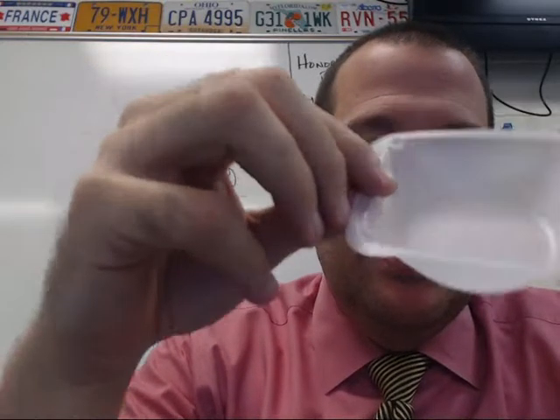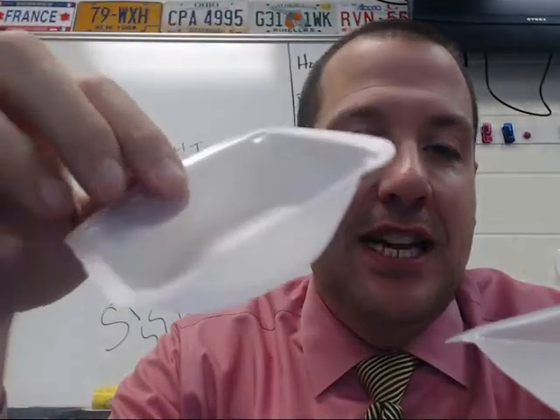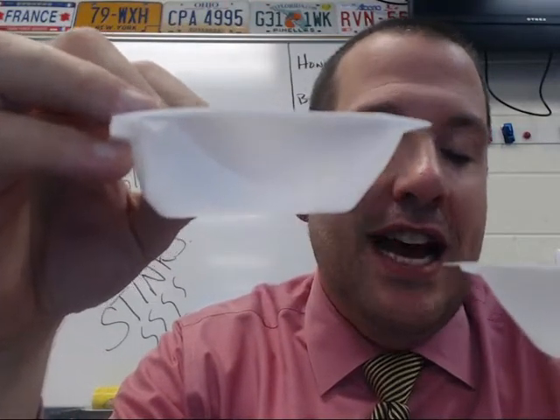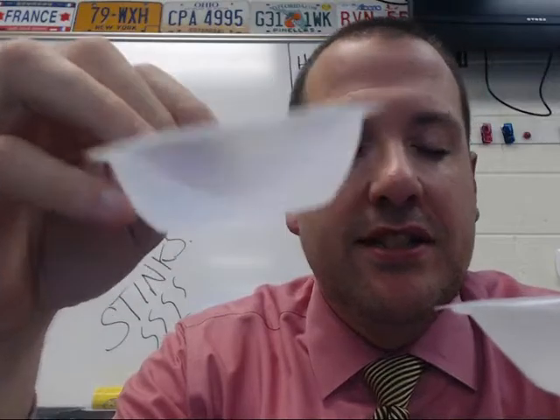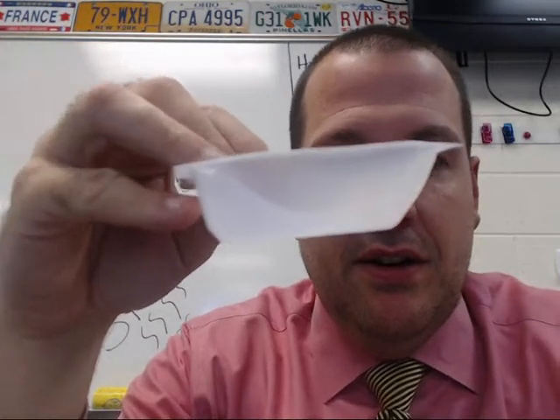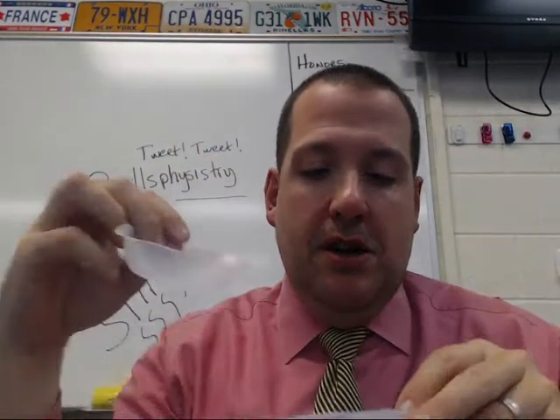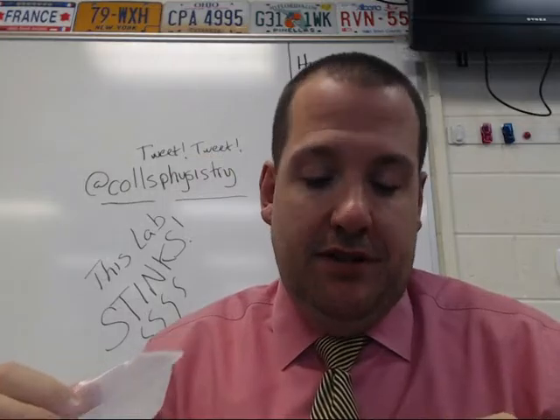Okay, realize because this is going to be a qualitative lab, you're not going to do numbers. You don't have to measure exactly the quantities that the lab asks for. You can just be about. And then you're going to make observations of these things, okay? The observations are going to be color, smell, whatever, okay?